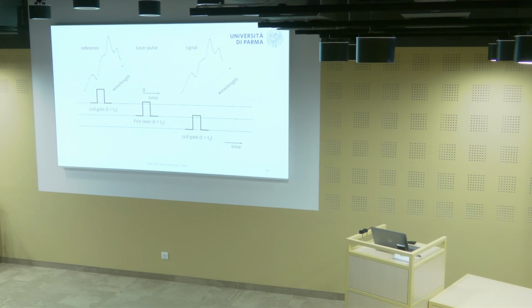You see they are different, and if you plot them together, you can clearly see that some regions have lower intensity, so here you have absorption, and higher intensity, here you have less absorption, than after the laser pulse, which means something changes in the color. You should measure the background, and my setup is quite old, so the background is very bad. You see it's quite high, but if you buy a new one, it's not as bad. So if you see something like this, they gave you an old detector, like mine. Probably it's mine.